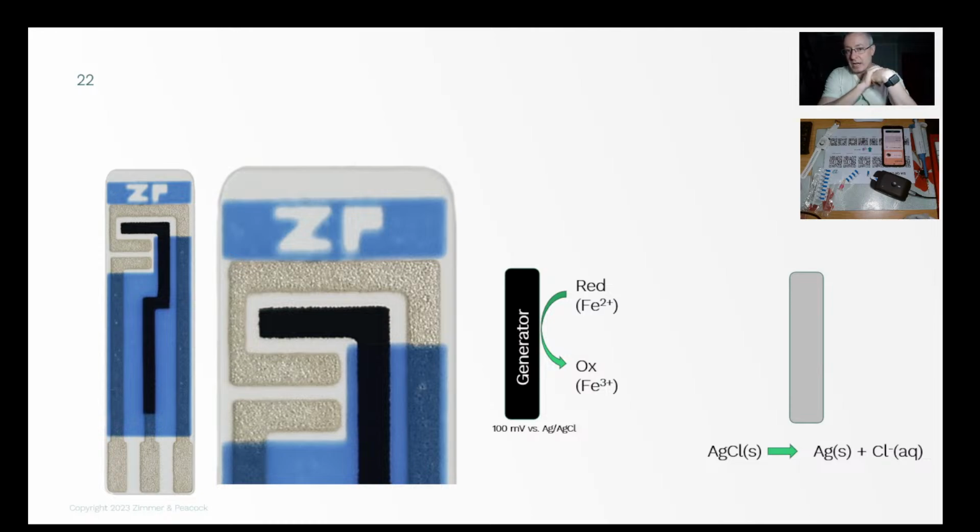So the dominant reaction in this particular case at our silver chloride electrode is not necessarily the reduction of ferricyanide to ferrocyanide, and therefore causing a closed feedback loop. In fact, the electrode's already given a facile reaction. It's a reduction of silver chloride to silver with a release of chloride. And before you start going, oh, well, there you are, you've got this new species. Yeah, we're often doing this kind of work in buffer solutions. And if you look at things like PBS, phosphate buffer solution, the chloride concentrations are actually quite high in these, like 135 millimolar. So the little bit of electrochemistry that you're doing will hardly disturb the chloride concentration.